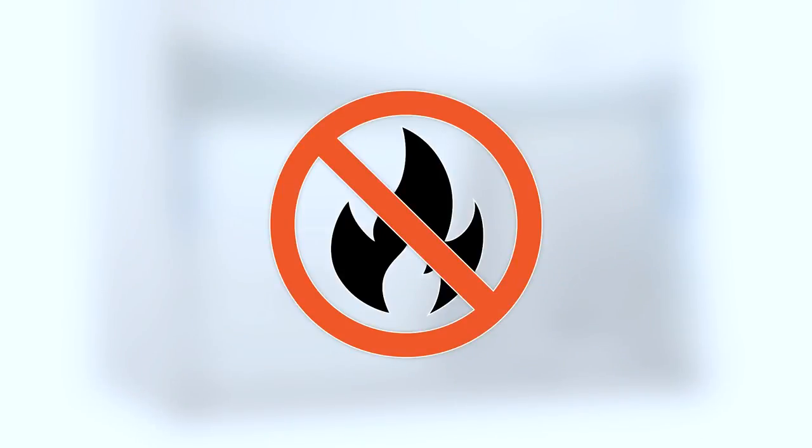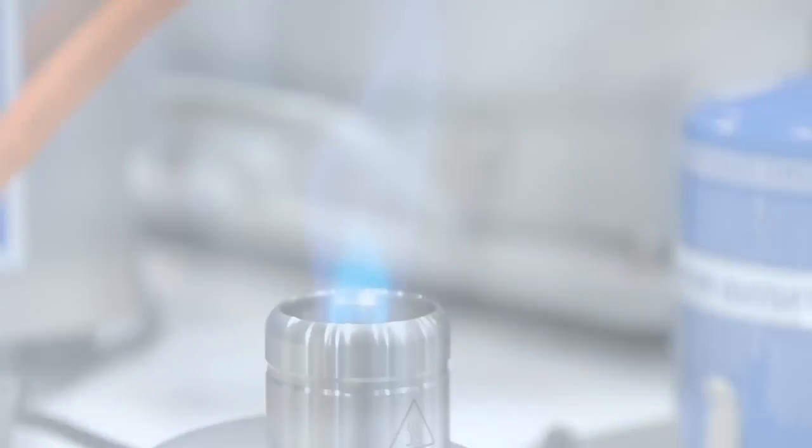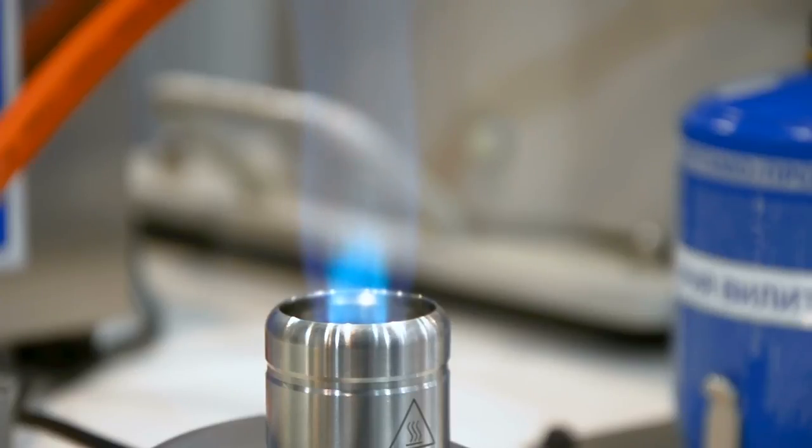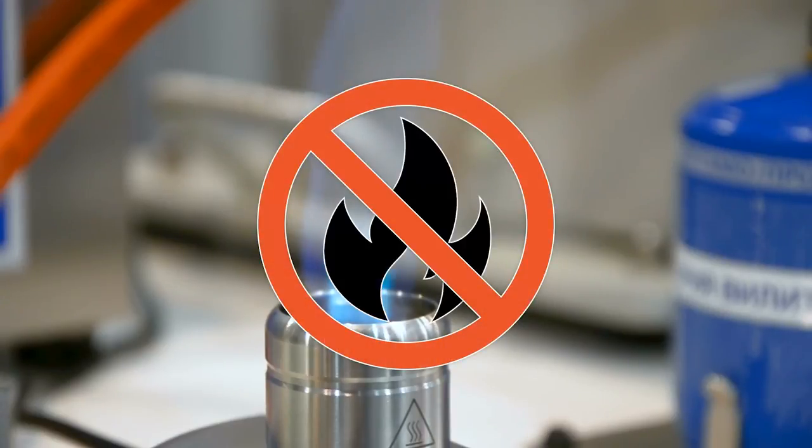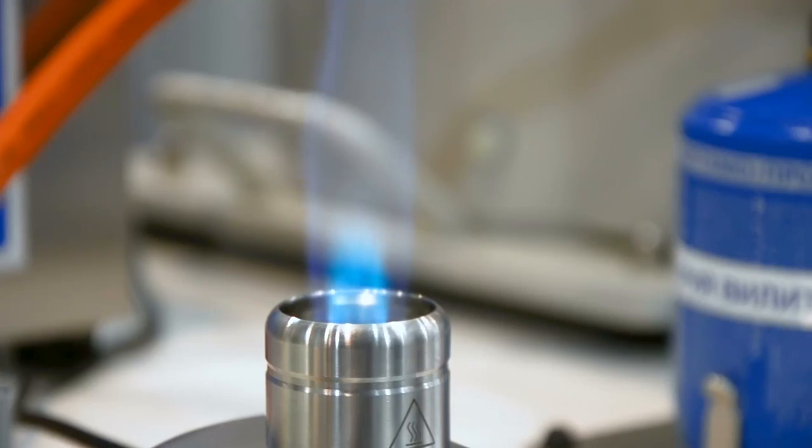Heat sources should never be placed within the biosafety cabinet. Heat creates turbulence within the cabinet and can cause cross contamination between samples. High heat items such as Bunsen burners may also damage the HEPA filters within the BSC. Instead, use single-use inoculation loops or other low heat sterilization tools.